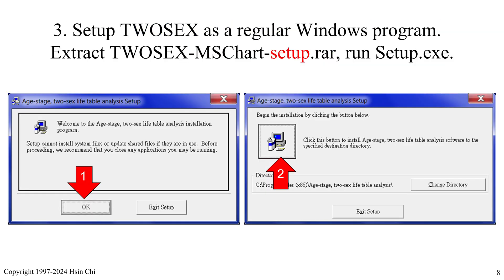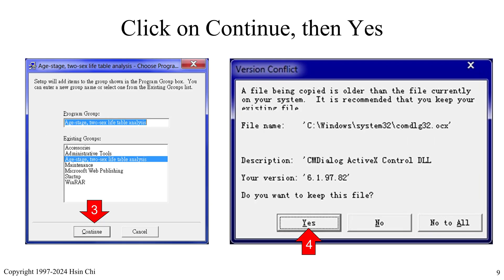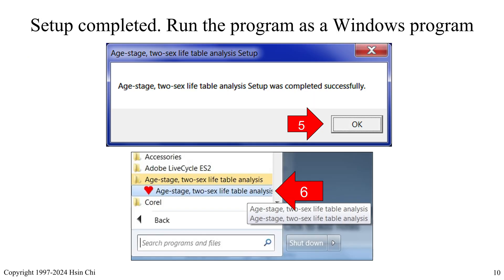The third way to run 2-Sex is to extract the 2-Sex MS Chart setup .rar file and launch setup.exe. Step 1: click OK. Step 2: click the large computer icon, then click Continue, then Yes. If you see the message that setup was completed successfully, please click OK. Now you can run the program as a Windows program.